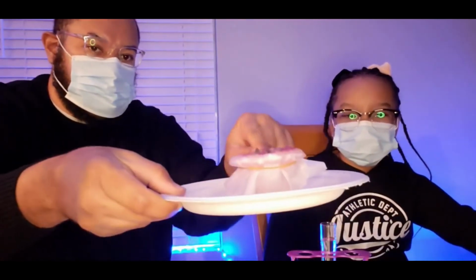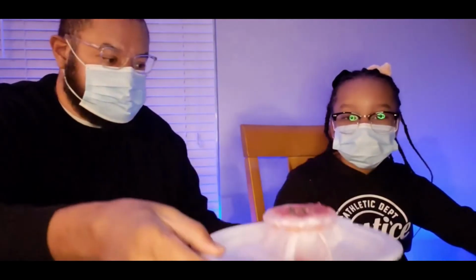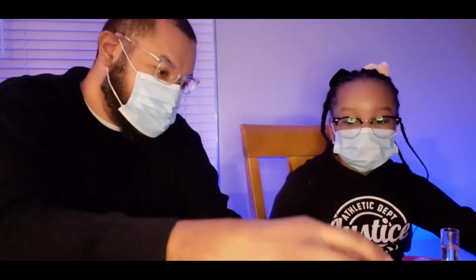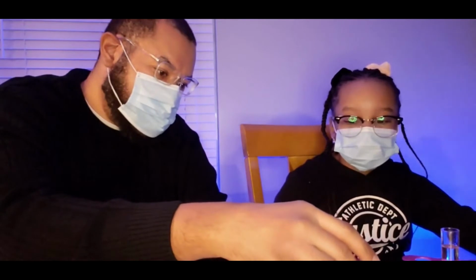Next step is saying to take our mixture here. What we're gonna do, we're gonna take this filter off. This is gonna be a little messy, to say the least. I'm gonna get the rubber band off of here.